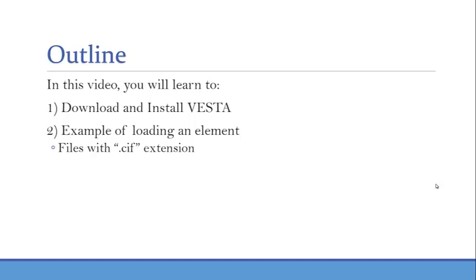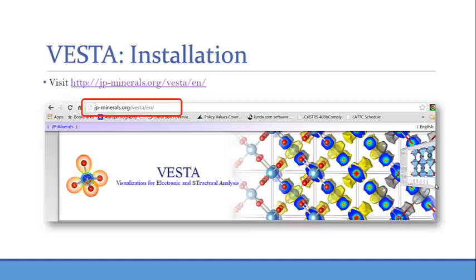So in this video, you'll learn how to download and install VESTA and also how to load an example file. More specifically, we're going to look at aluminum, face-centered aluminum, and what we can do with the program.